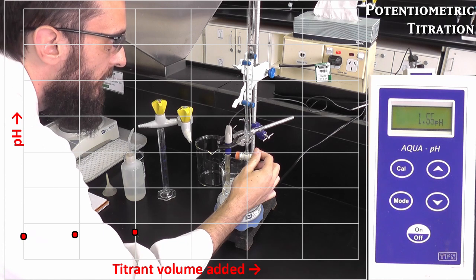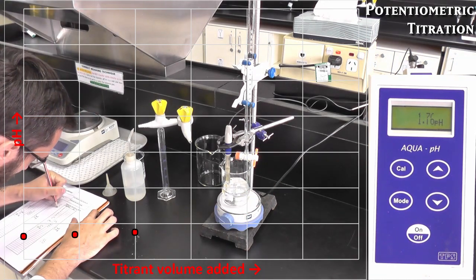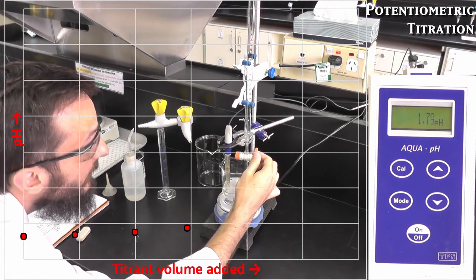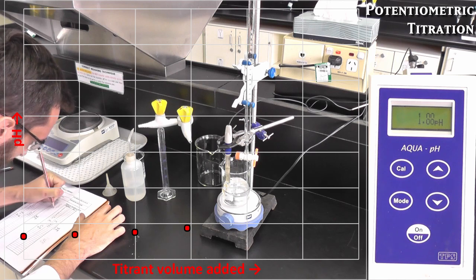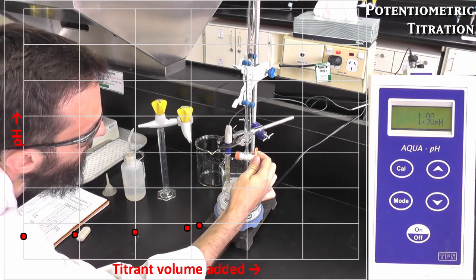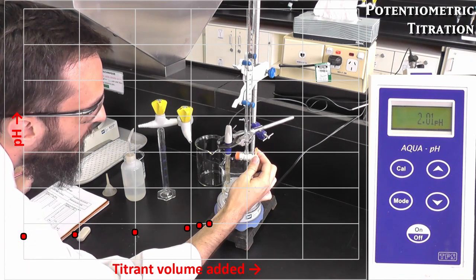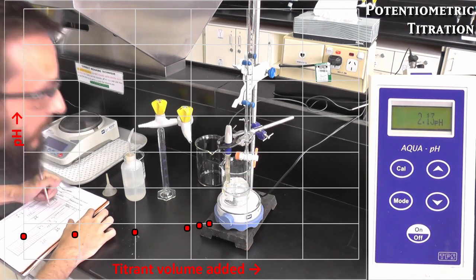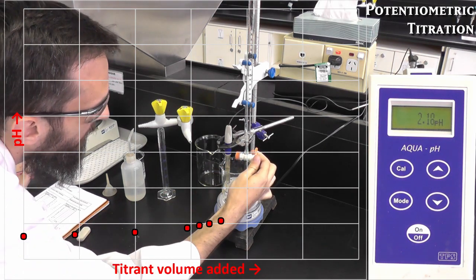The first few additions are rather large volumes, somewhere in the order of 5 milliliters. However, we only see a very small change in the pH. We're most interested in the data around the equivalence point, where the titration curve begins to increase its slope until it's essentially vertical. It's important to capture as many data points around this near vertical portion to obtain the most accurate equivalence point. The volumes being added for each measurement have now decreased as the slope begins to increase.